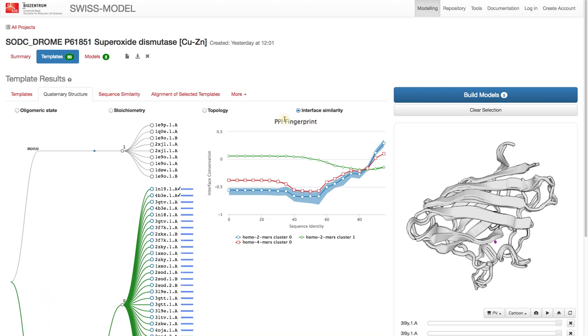Here on the x-axis we see the sequence identity and on the y-axis interface conservation. These plots inform about the conservation of template interfaces.